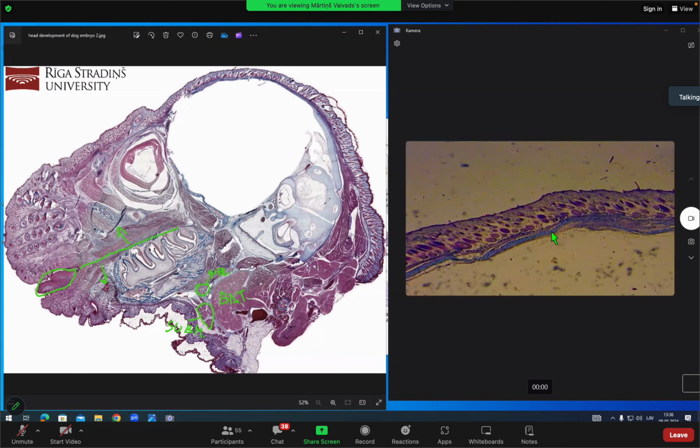Inner ear, same idea. If you see round openings inside hyaline cartilage, developing semicircular canals. So developing semicircular canals are all of these small openings. Semicircular canals, SC. I don't have the slide on the slide plate. Most likely it's on the top floor or some other plate, but this is also a variation of the dog's head. Okay, we need to move on.